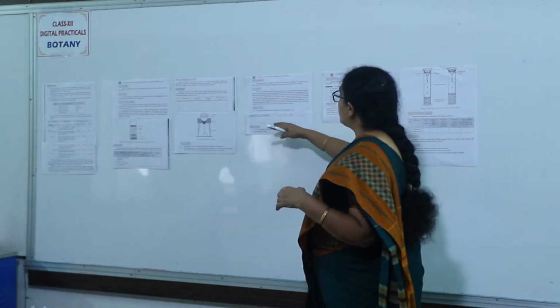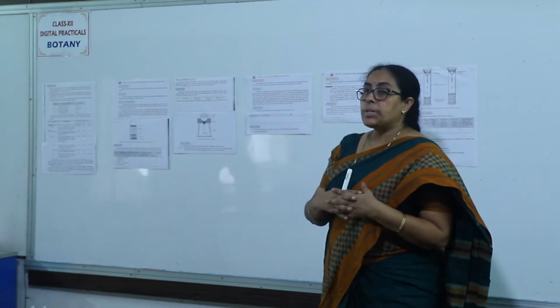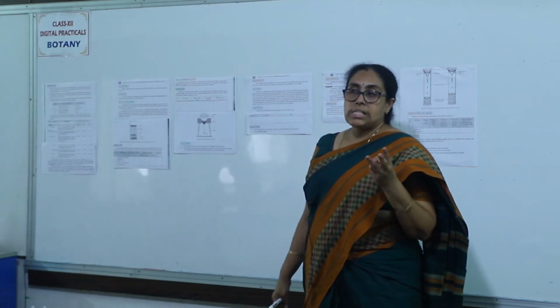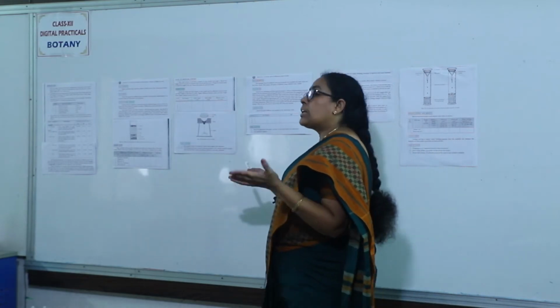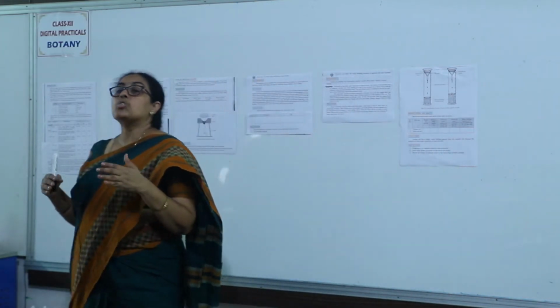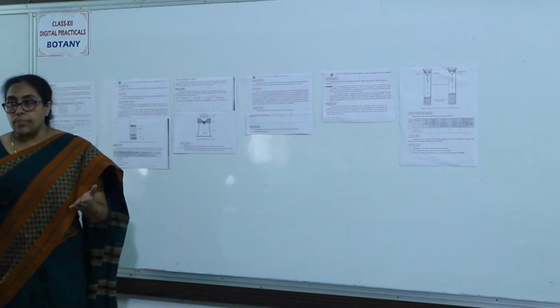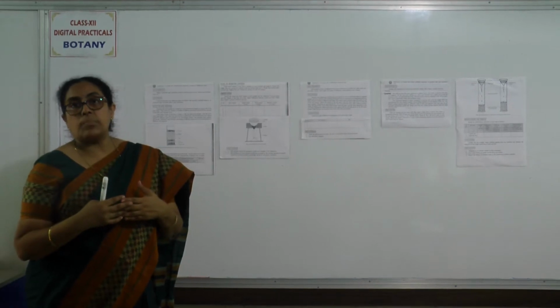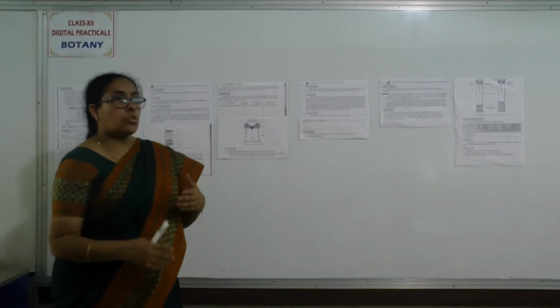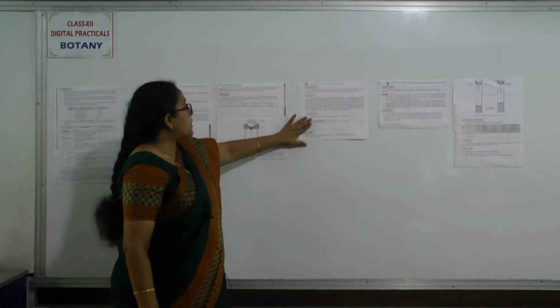By using these two soils, we are determining what type of pH it has, whether it is acidic, alkaline, slightly alkaline or slightly acidic. That also helps in determining which type of crop or vegetation will be available in that area. So that also helps in the process of agriculture. That is being explained here.